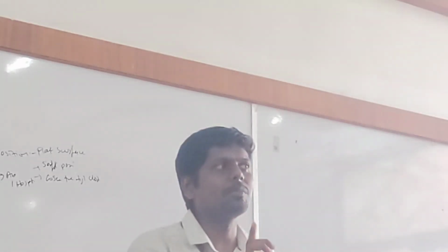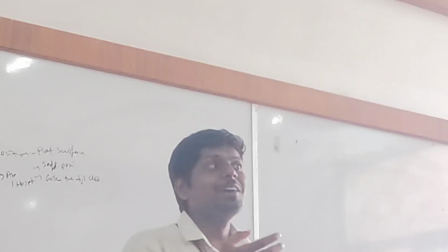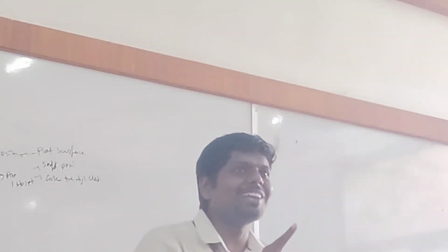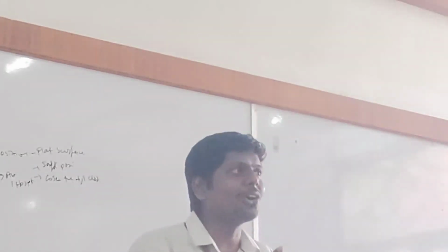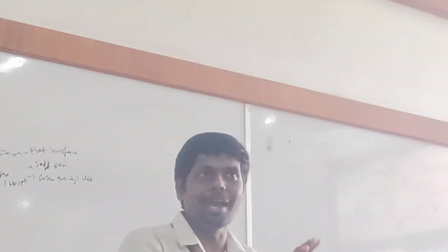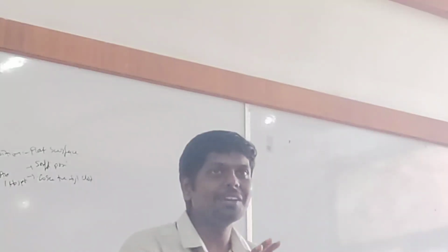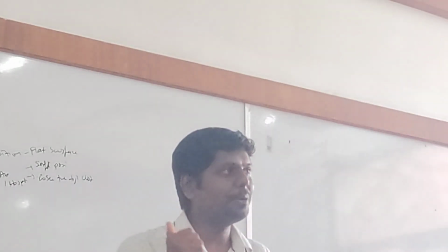Keep your lab coat on. From day one onwards, we have had safety protocols, especially in my lab. But still there was an emergency, and you managed it. I really appreciate it, but ensure these things, okay? Don't panic and respond on time.